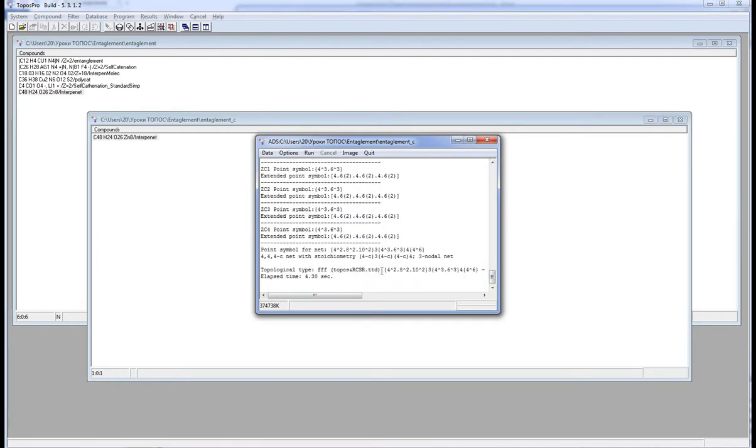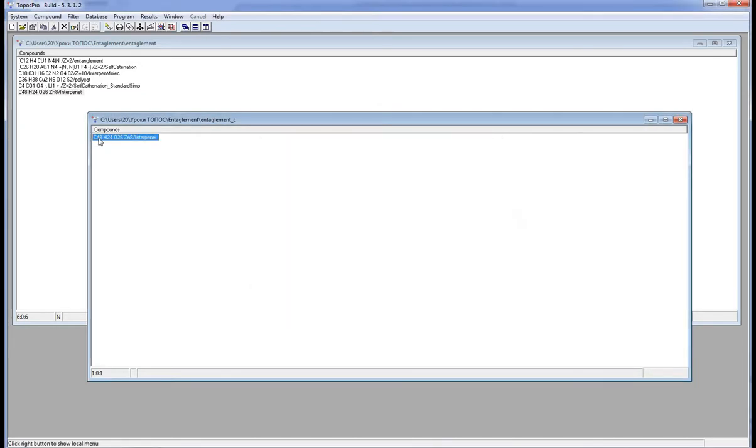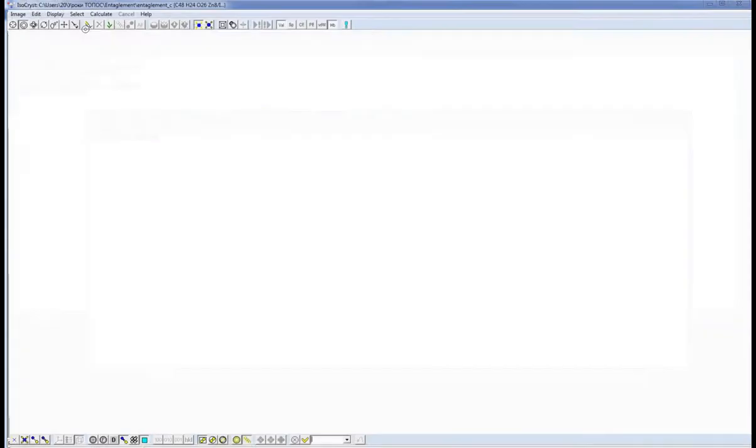You can find more information about the nomenclature for the interpenetration parameters in the ToposPro practical manual on the site topospro.com and in the corresponding articles. We can look at the structure and make sure that it has 2 interpenetrated nets.